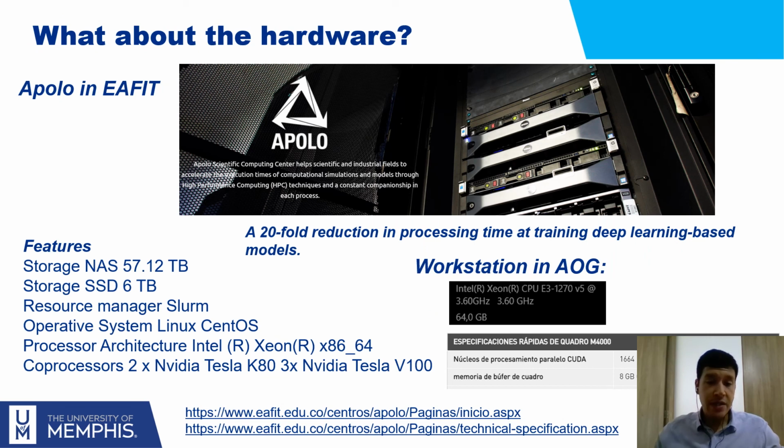Well, the hardware requirements: in this case we need powerful machines. If we want to train a CGAN, for instance, we will need a lot of time, and regular machines are not going to be able to achieve the training times that we are expecting, that is to train images of 1,000 by 1,000 pixels, for instance, and 1 megabyte of images. We will probably not be able to do that with a regular laptop. So we need something powerful, that is true.